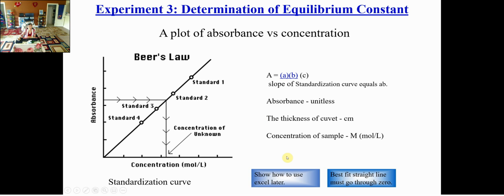You prepare different concentrations and measure the absorbance for each. You plot a graph using absorbance as y and molar concentration as x. Absorbance is a unitless value.